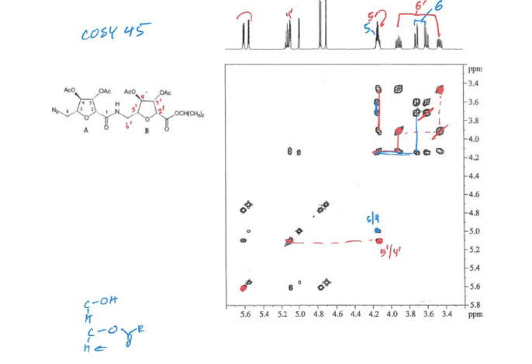I think that this one, notice this has extra peaks in here too, but I think that goes to this isopropyl group out here, is the more coupled one. There's probably a septet right under there for this proton. Okay, so the one to the right side there is the 4 prime, and from here, this goes across to here, and so this is 4 here.